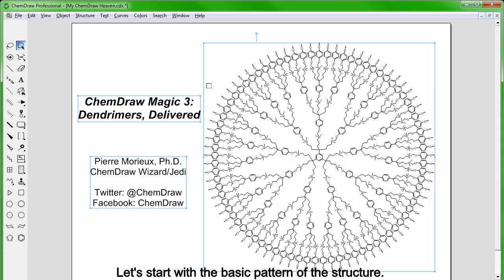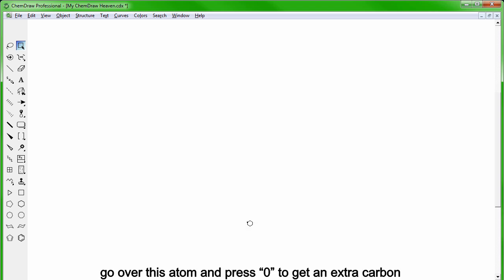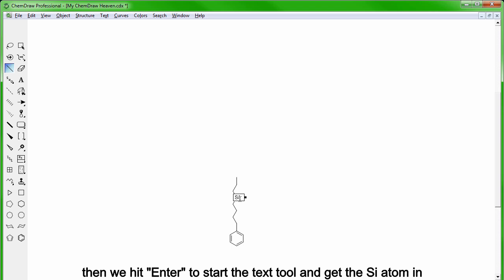Let's start with the basic pattern of the structure. We start with a benzene ring. Go over this atom and press 0 to get an extra carbon. Then we take the chain tool to add a few other ones. And then the single bond tool that we use to orient the last one up. We can go over this atom and then press 9, which will sprout 2 carbon atoms. Then we hit enter to start the text tool and get the silicon atom in. Finally, we go over this one and press O to get an oxygen.